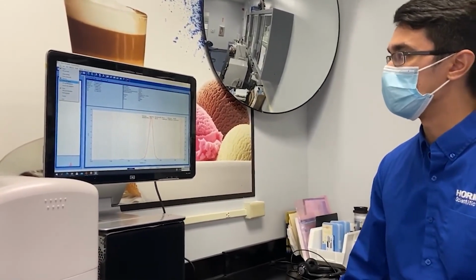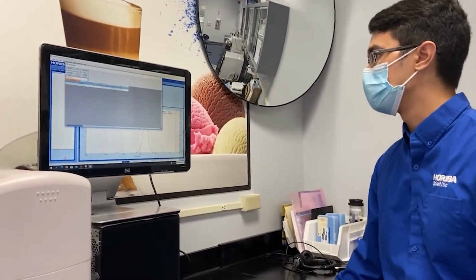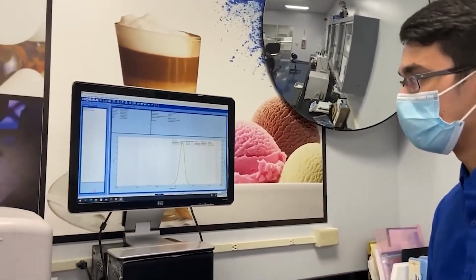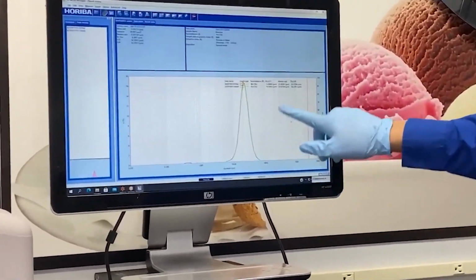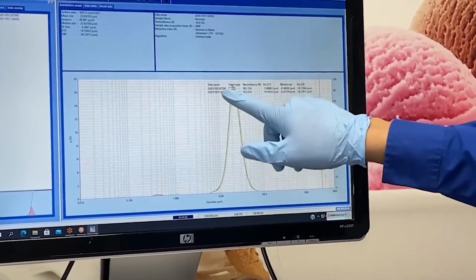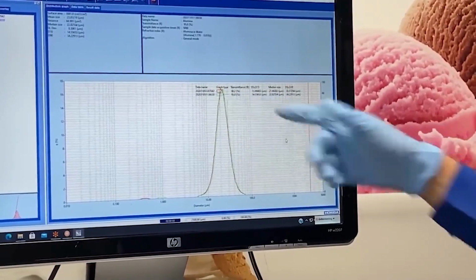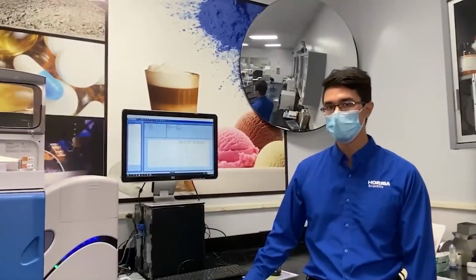So if I go to the database, I've done 2 runs so far, the first one being wet, so I'll go ahead and load that. And we can compare the overlay here. And you can see that they overlap quite well. Our median is 22 for the dry measurement and 22.8 for the wet, so very similar, and very similar shape as well. Demo for the instrument.